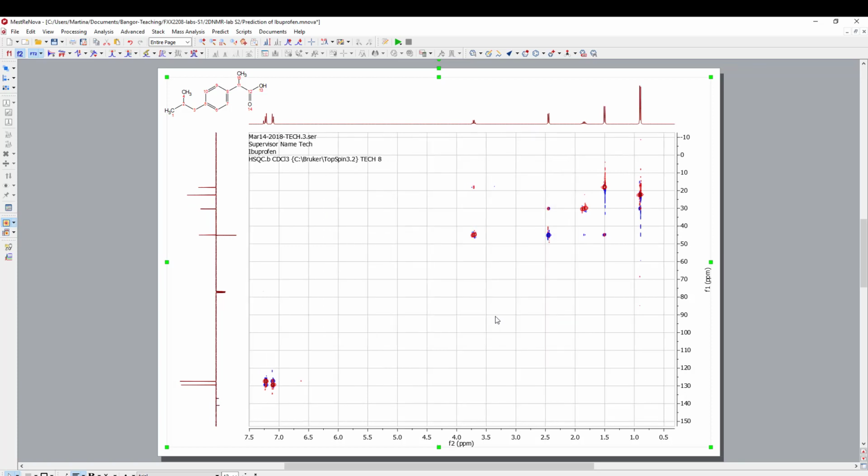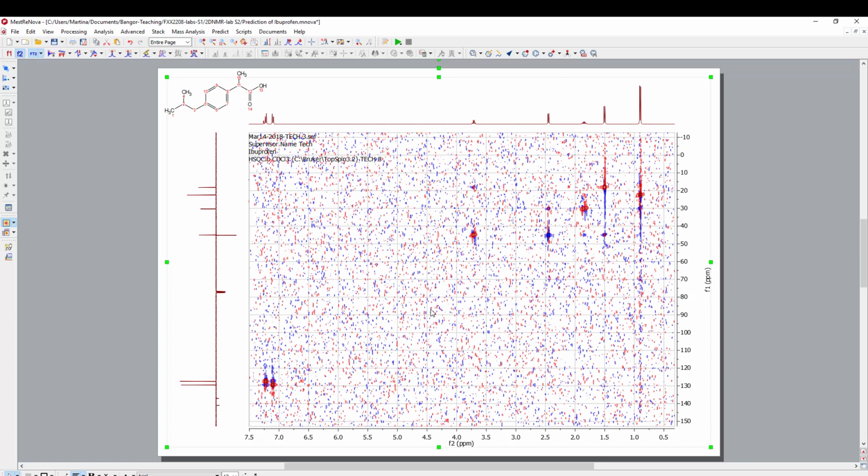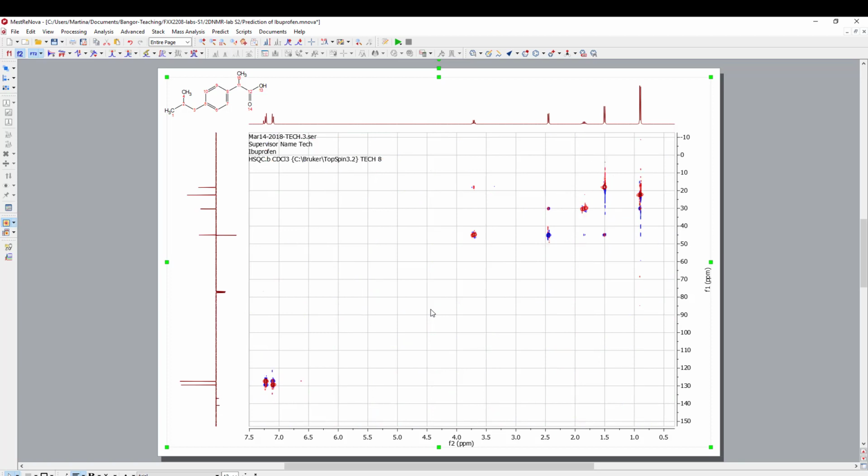So this has happened. Then, as it is a COSY type technique, we can again use our middle mouse wheel to increase or decrease the depth of the spectrum. Again, we can go down quite substantially until we only see the so-called cross spots. Something is different to the COSY.